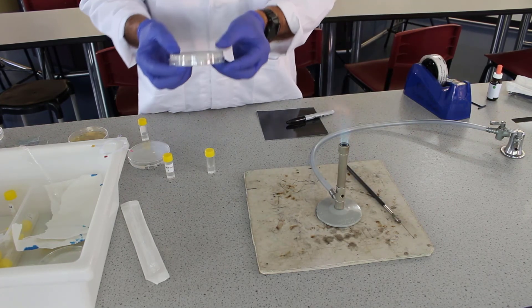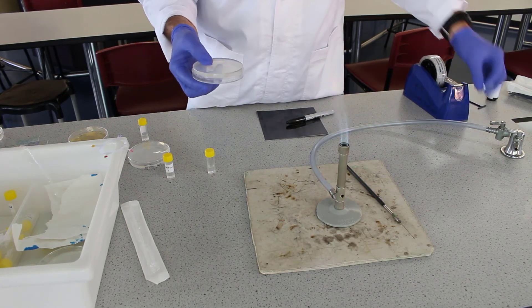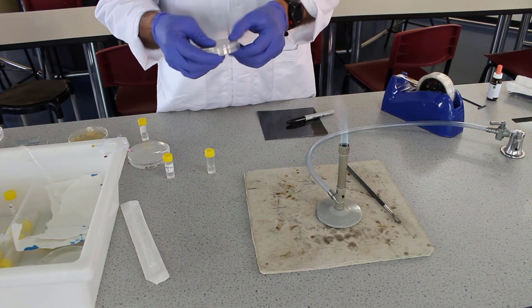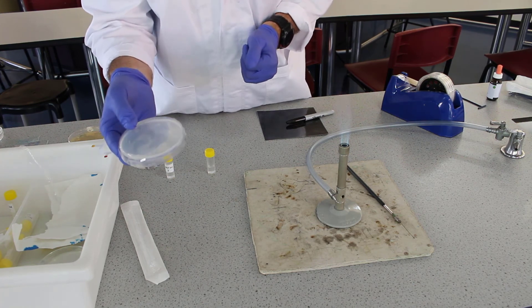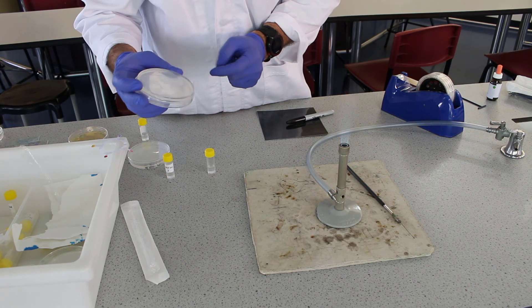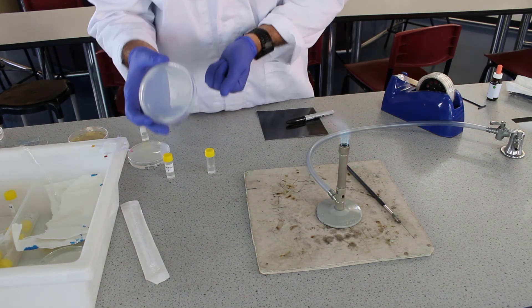Now we're going to seal this plate by putting on some sticky tape, and then we're going to incubate it for approximately 48 hours. Only then can we really see how our 16-streak turned out and how our single colonies turned out.